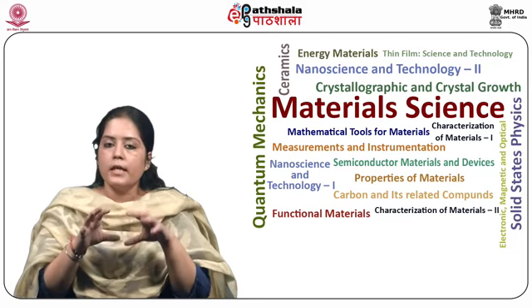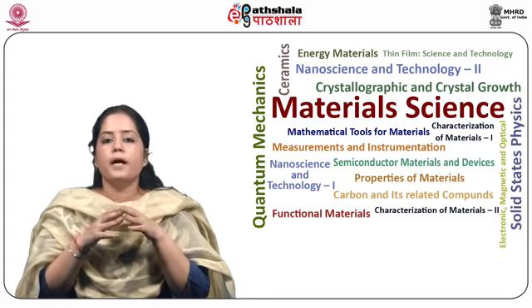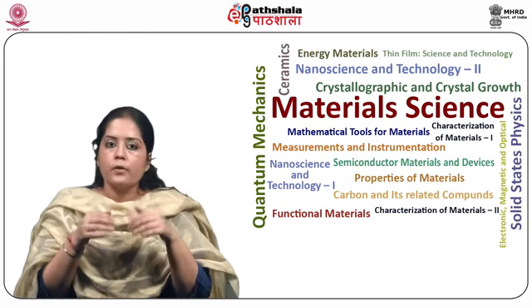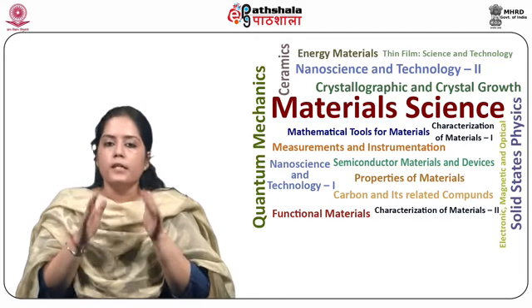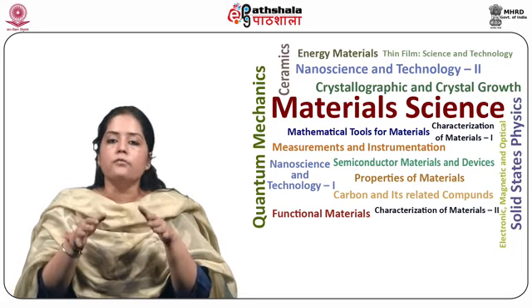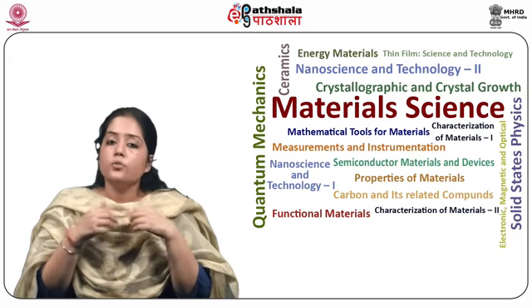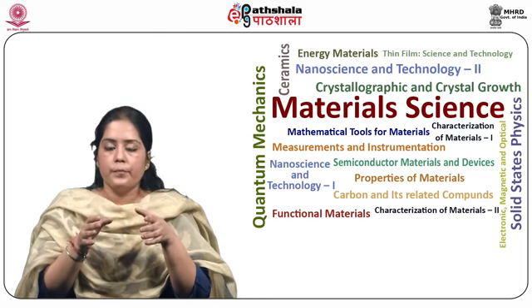So the iodine reacts with the gaseous tungsten formed by sublimation and produces a volatile compound WI2. As WI2 molecules hit the filament, they decompose and redeposit the tungsten back on the filament. Tungsten halogen lamps usually have a lifetime twice that of the conventional tungsten filament lamp.